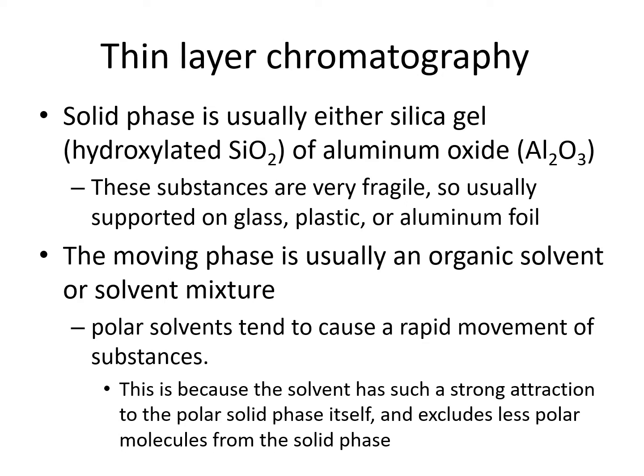And the second technique is thin layer chromatography, which we'll be discussing in detail in this experiment.